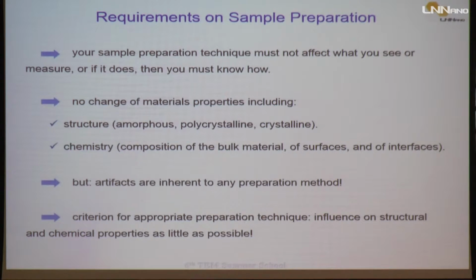This is very important before choosing which kind of sample preparation technique you use. Because if you are dealing with structural properties, you need to do some high resolution TEM or diffraction and so on.